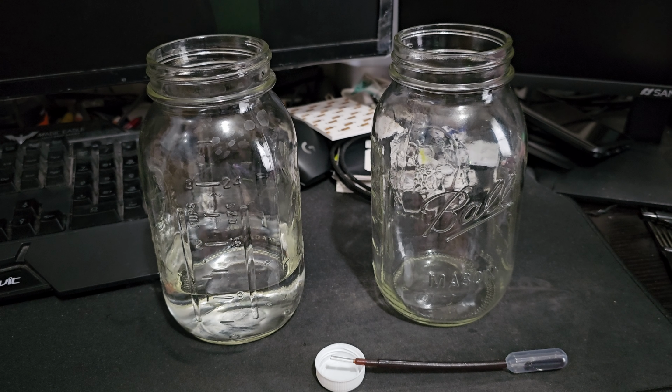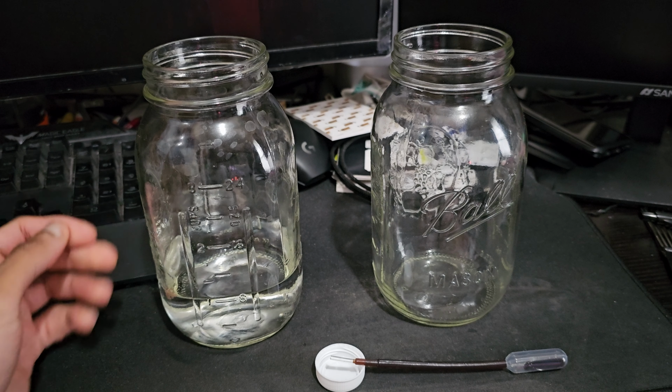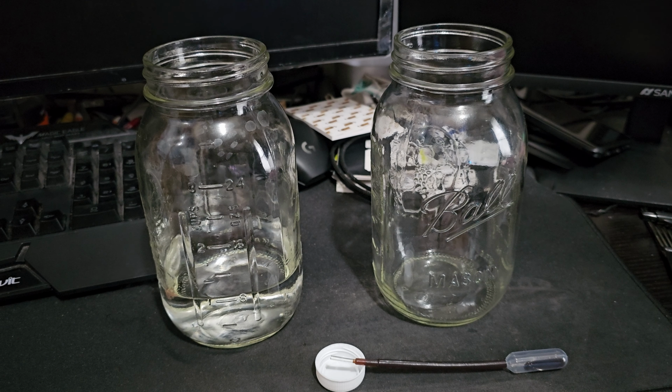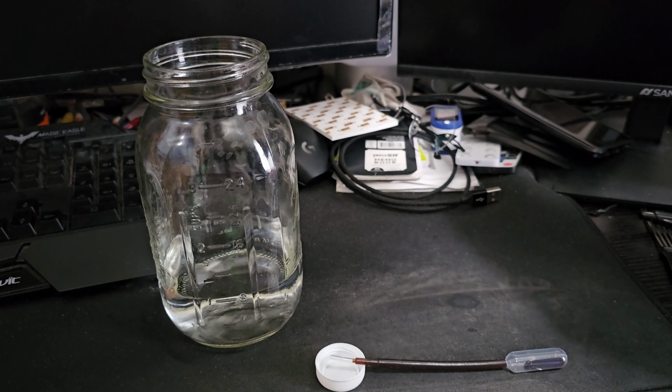Alright, I've gathered my supplies. This right here is about 8 ounces of some fish tank water. The fish tank, I think, is a 55 gallon or something. It just has an Oscar cichlid in it, and I just got a little bit off the top, so that should be fine for this. And here I'm going to put some distilled water. Let's put about 8 ounces in there as well.